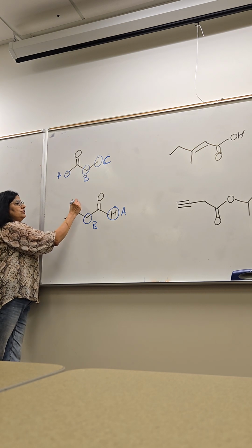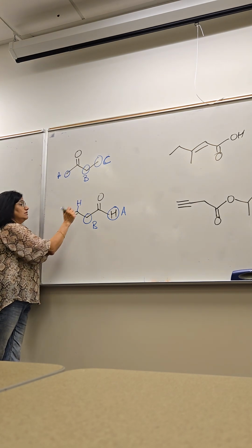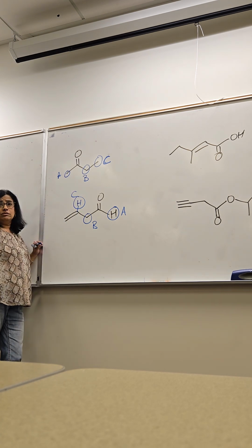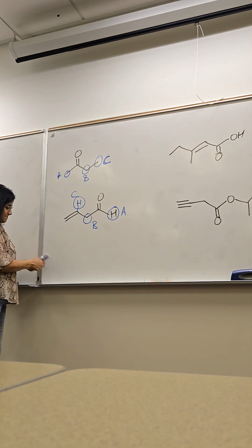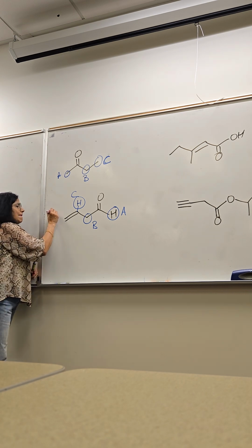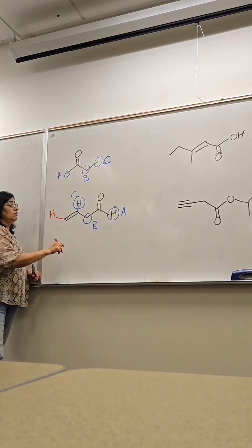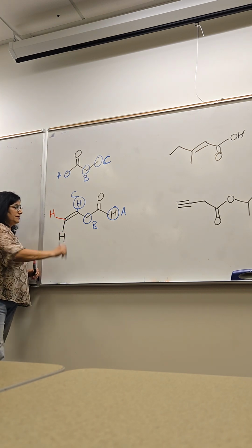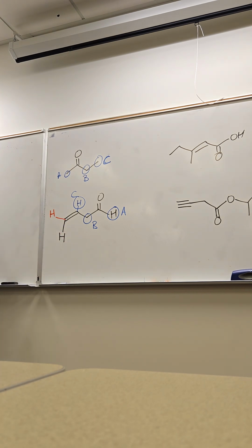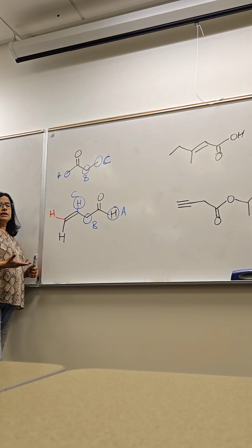Do you agree there's a hydrogen here? Is there any other hydrogen like that? No. That's unique on its own. So where's the tricky part? The double bond at the end. Is this hydrogen the same as this hydrogen? Please look at the whole molecule. No. What's their relationship? They're diastereotopic hydrogens.